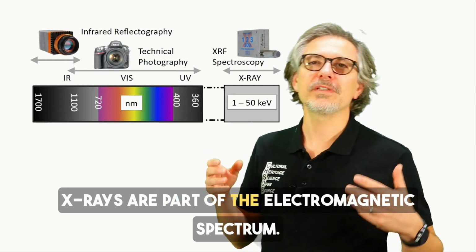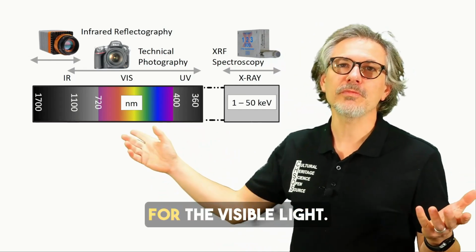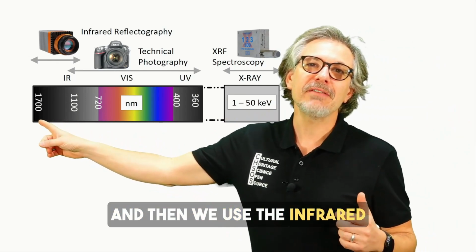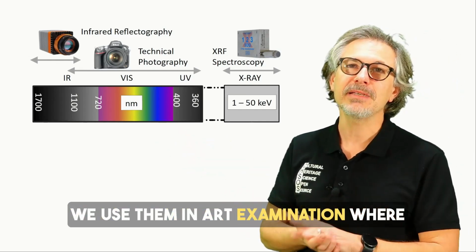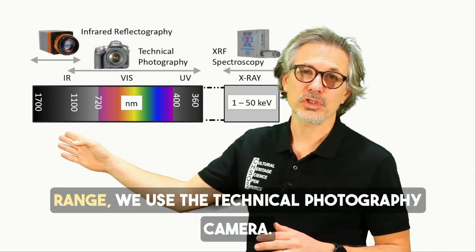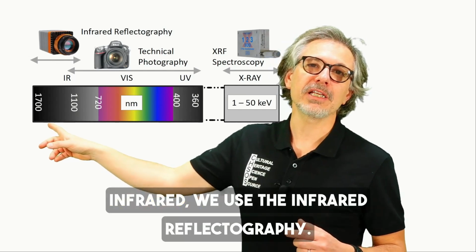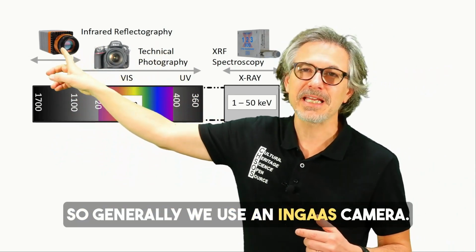X-rays are part of the electromagnetic spectrum. We use the electromagnetic spectrum for visible light, so we detect it with our naked eyes, and then we use the infrared spectrum and the ultraviolet spectrum. We use them in art examination, where, using this range, we use the technical photography camera, and when we go further into the infrared, we use infrared reflectography, so generally we use an InGaAs camera.